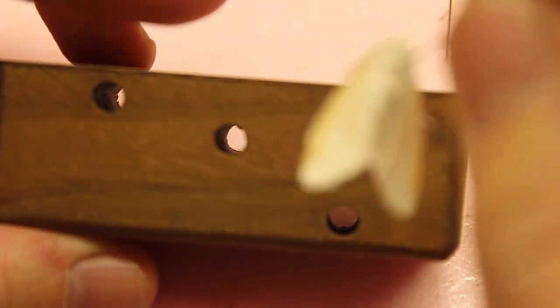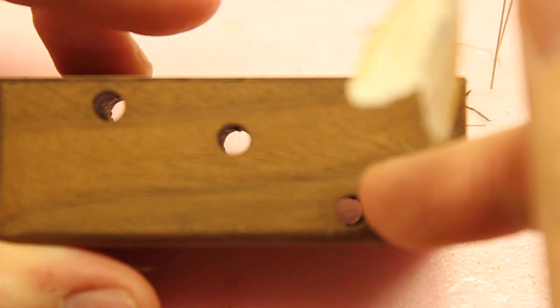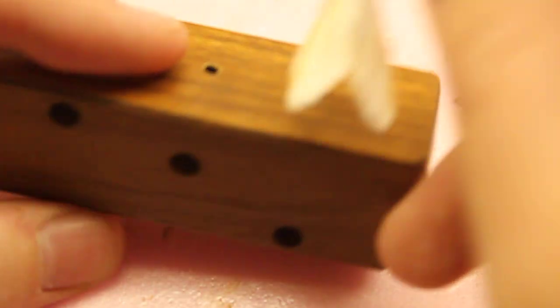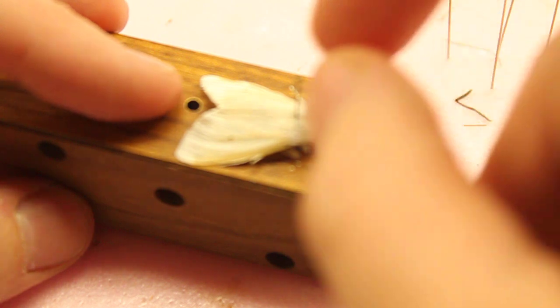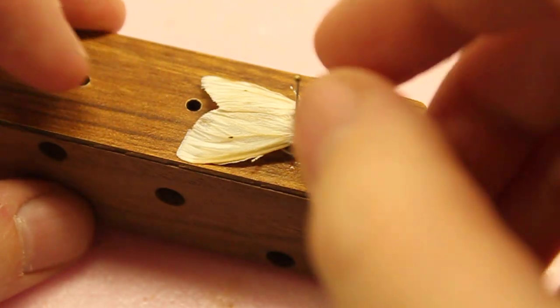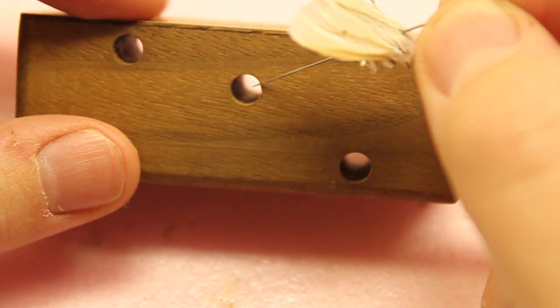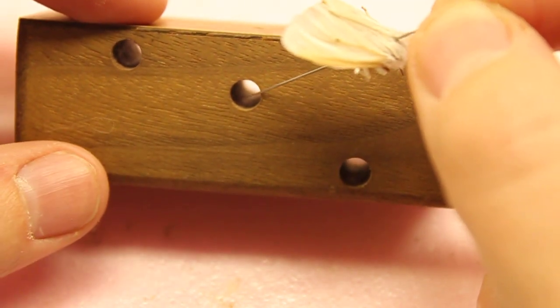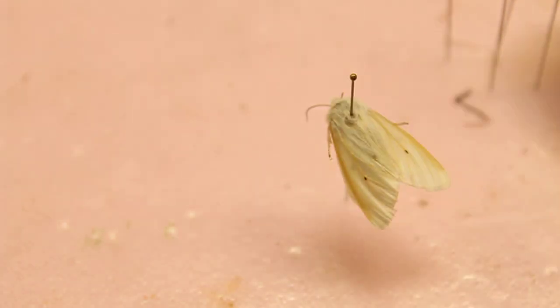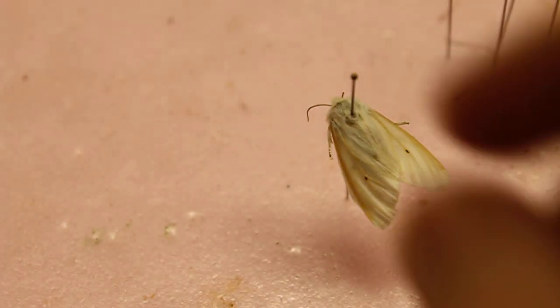We'll put it in this block right here. This hole is for the bug — like if you were at a fair, this is where you'd put the insect. This hole here is for the name label, and then this one would be for the date label.